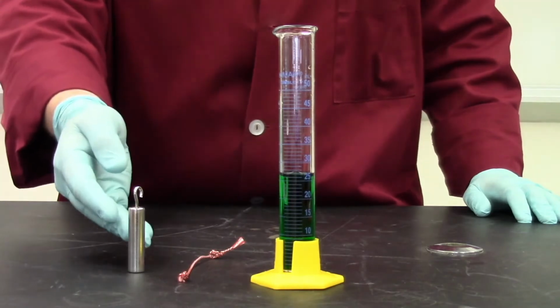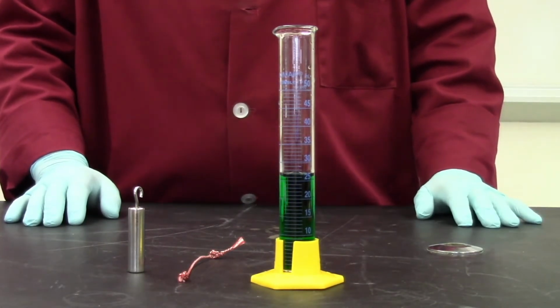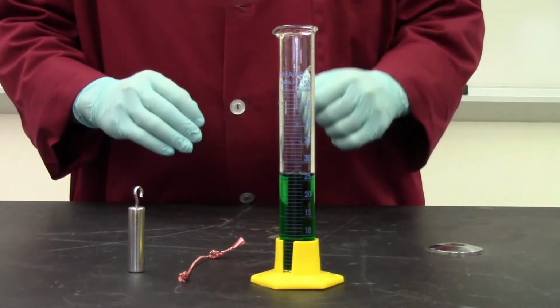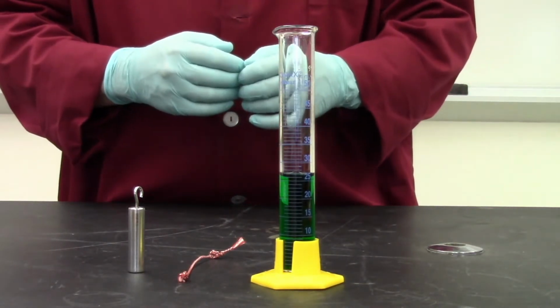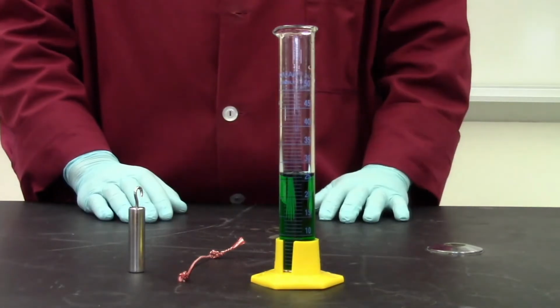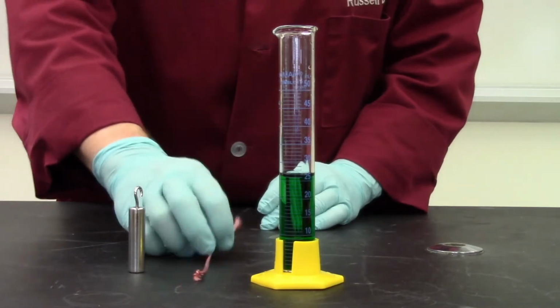of the object. It's much like when you take a bath at home. When you fill up the tub, you don't fill it right to the top. Why not? Well, because when you get in the tub, your volume is going to displace the volume of water. You've noticed, when you get into a bathtub, the water level significantly rises because you have volume, just like this object here. So let's do the experiment.